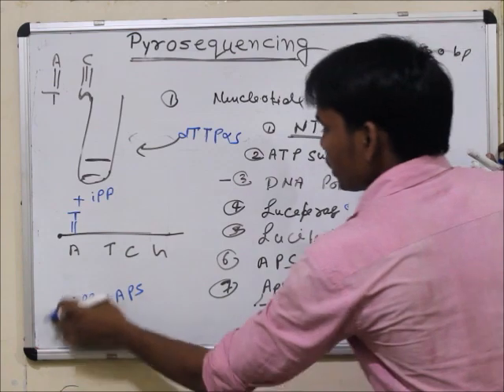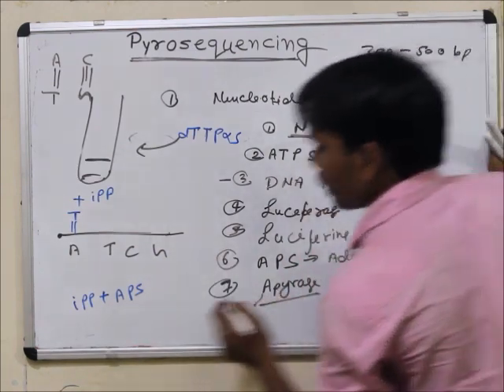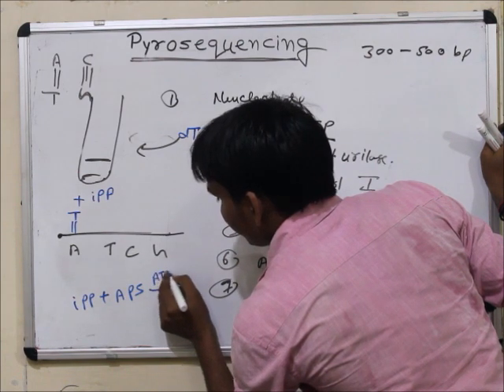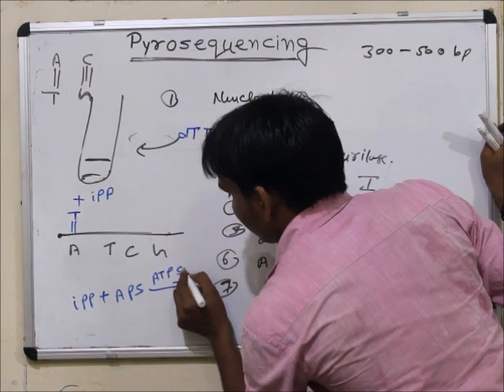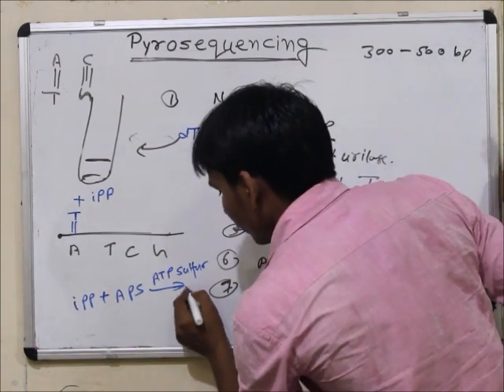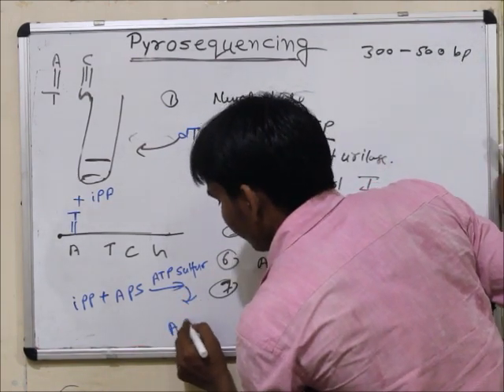In the presence of ATP sulfurylase, it will convert into ATP.